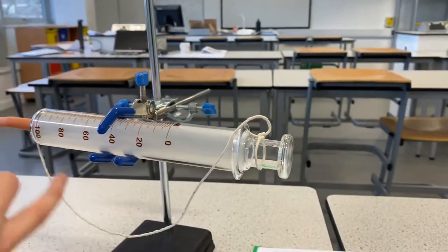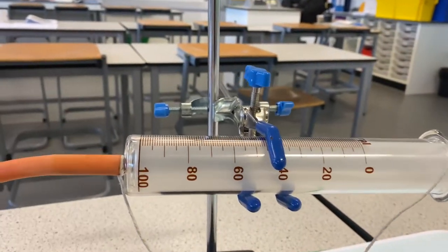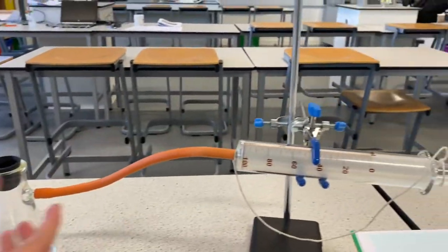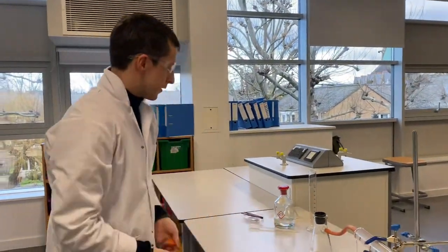The gas syringe will measure the volume of hydrogen gas produced. A gas syringe is really good for when you're measuring things like hydrogen gas. It wouldn't be so good for this experiment if we had CO₂, for example, because CO₂ would dissolve in the water.